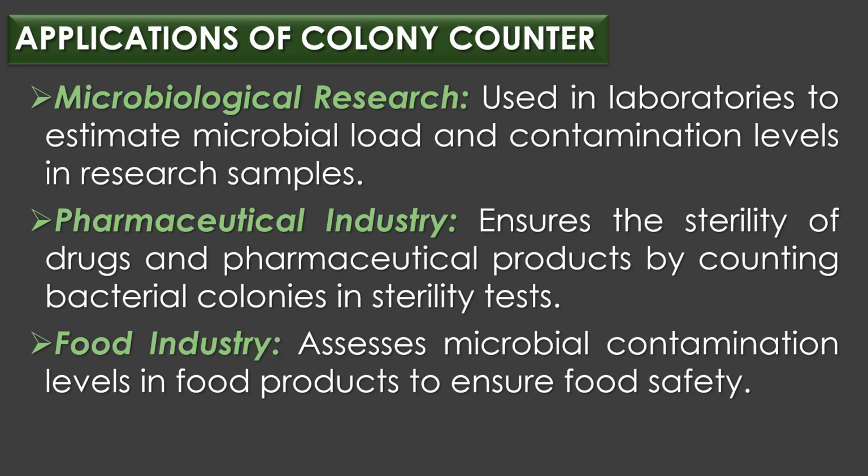Applications of colony counter. In microbiological research, colony counters are used in laboratories to estimate microbial load and contamination levels in research samples. In the pharmaceutical industry, colony counters ensure the sterility of drugs and pharmaceutical products by counting bacterial colonies in sterility tests. In the food industry, colony counters assess microbial contamination levels in food products to ensure food safety.